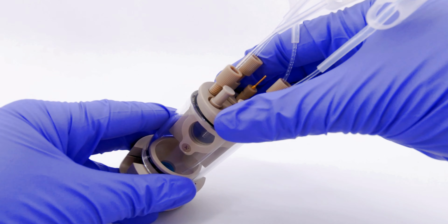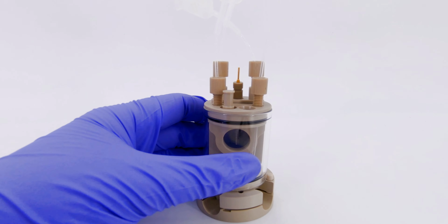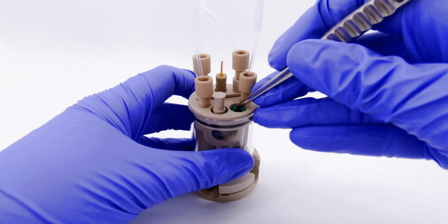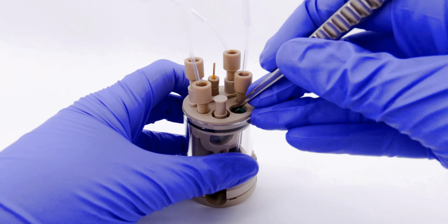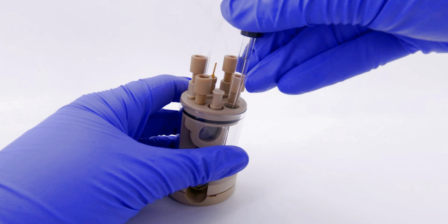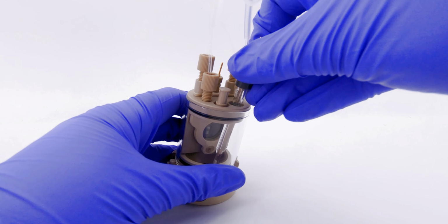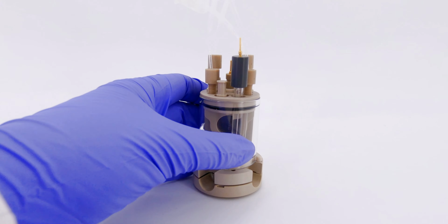Now, twist the lid onto the glass body, remove the plug, add an O-ring, and then introduce the reference electrode just like we did for the previous cell. And there you have it. This cell too is all set up for your experiments.